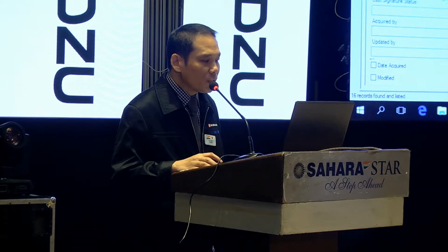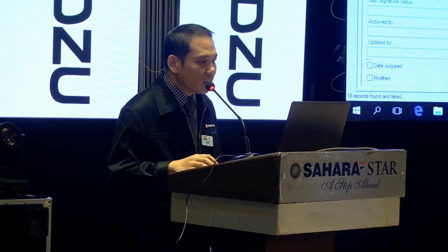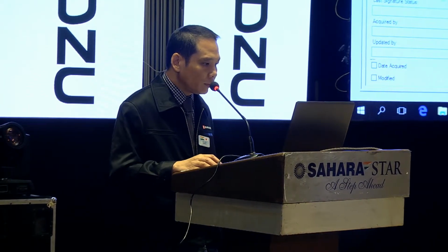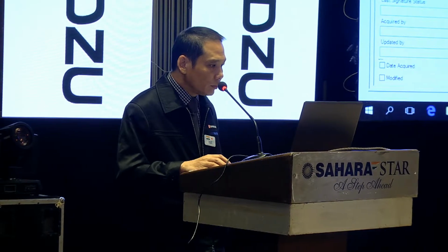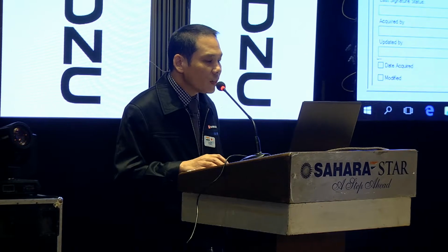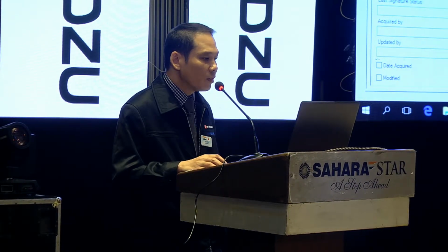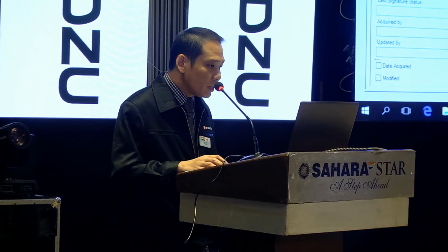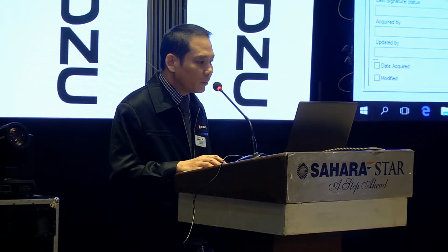So if you want to see the weighing result, you just click. So this is your weighing result, registered in the server now. Sample 1, date, the data, okay, so the date.